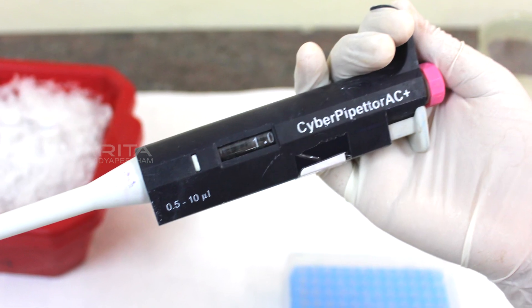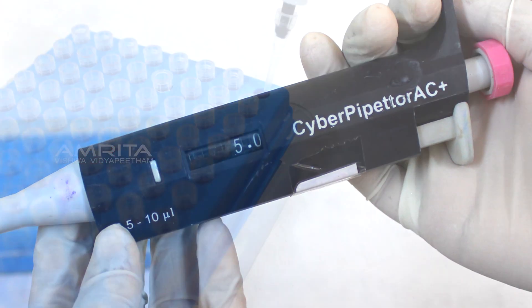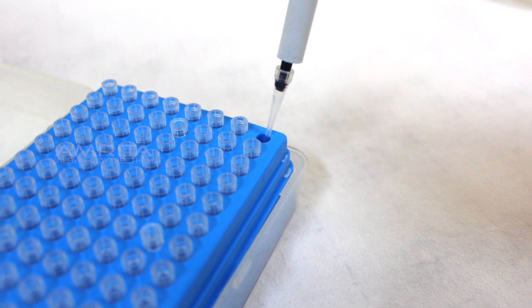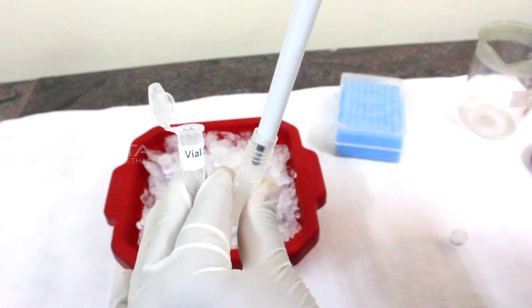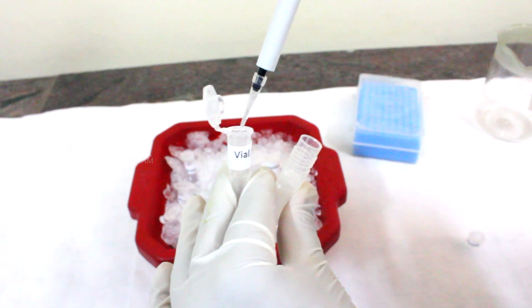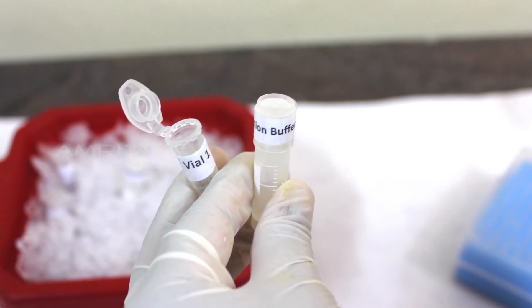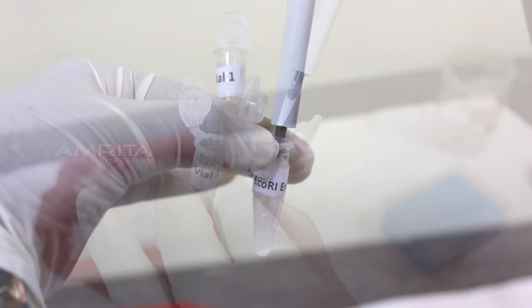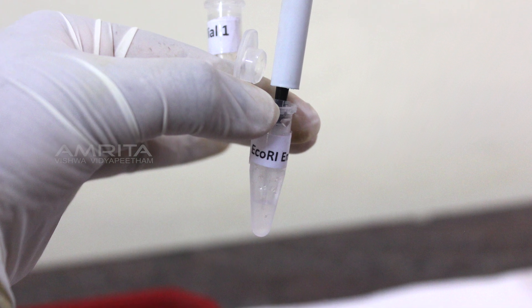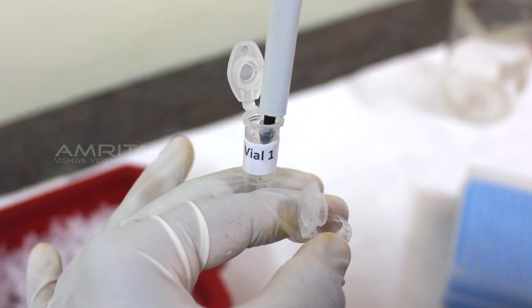Take a 10 microlitre micropipette and adjust to 5 microliters. Insert a fresh micropipette tip into it and transfer 5 microliters of deionized water to an empty vial labeled vial 1. Similarly, add 1 microlitre of 10x reaction buffer, 3 microliters of plasmid DNA, 0.5 microliters of EcoR1 enzyme and 0.5 microliters of BamH1 enzyme to the same vial.